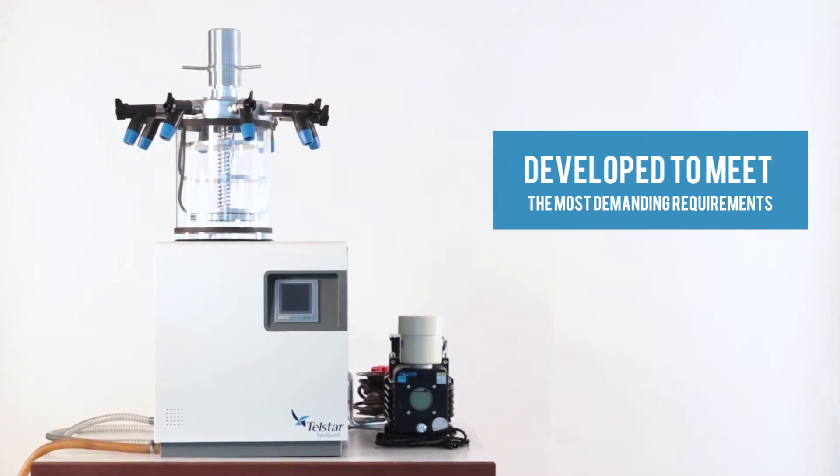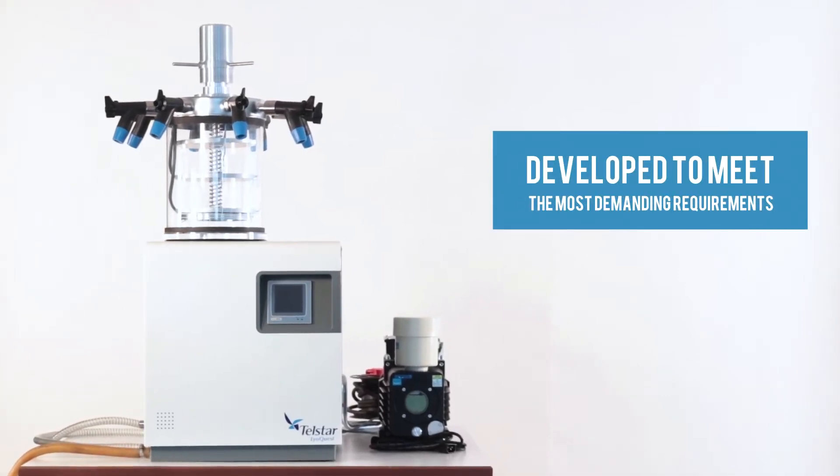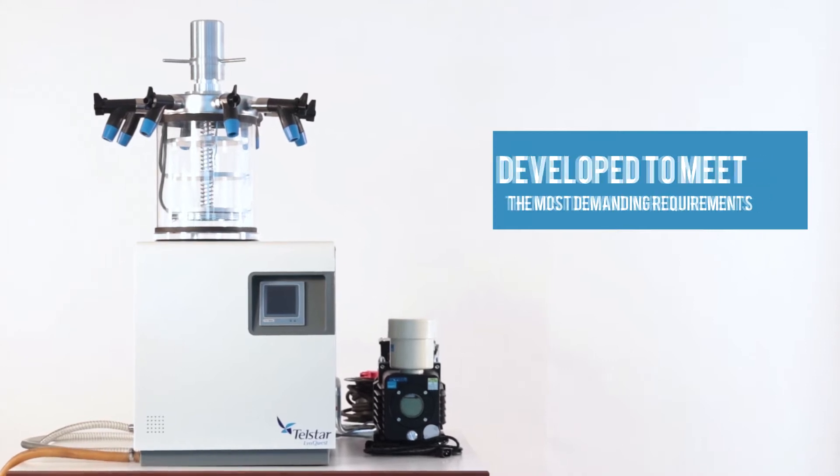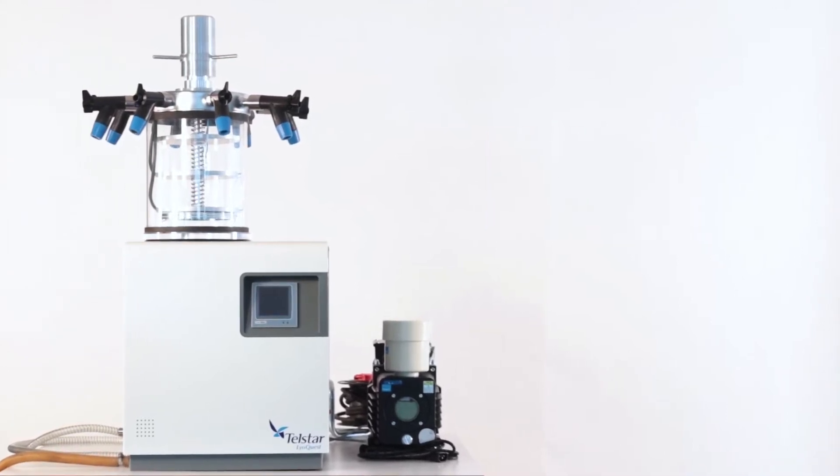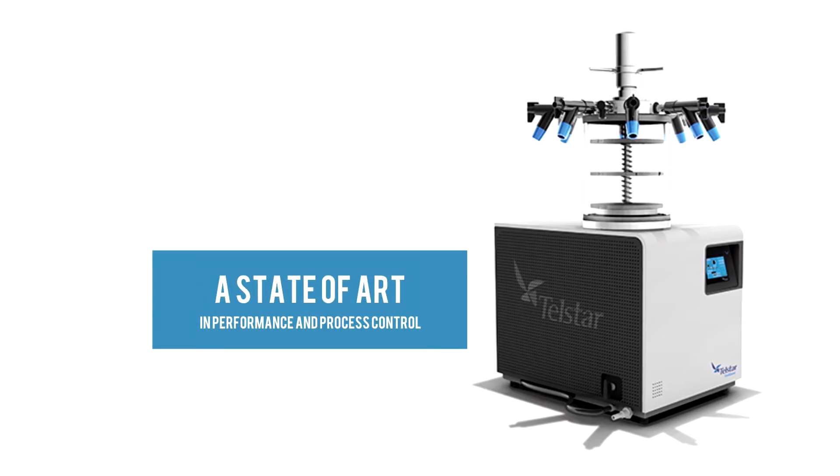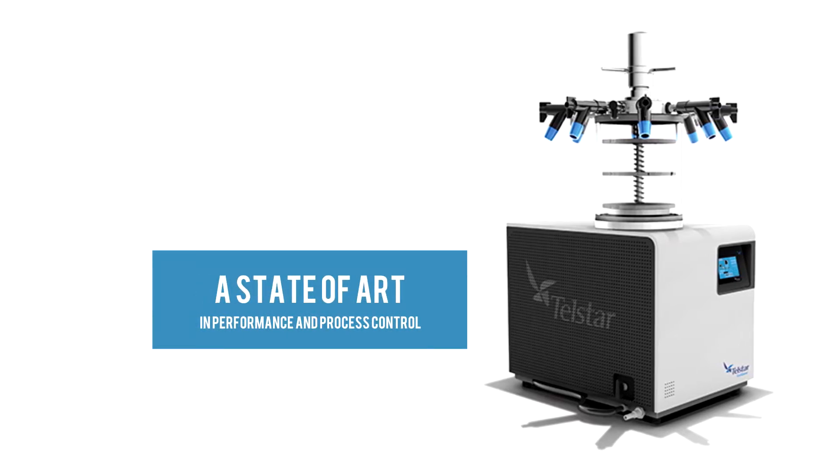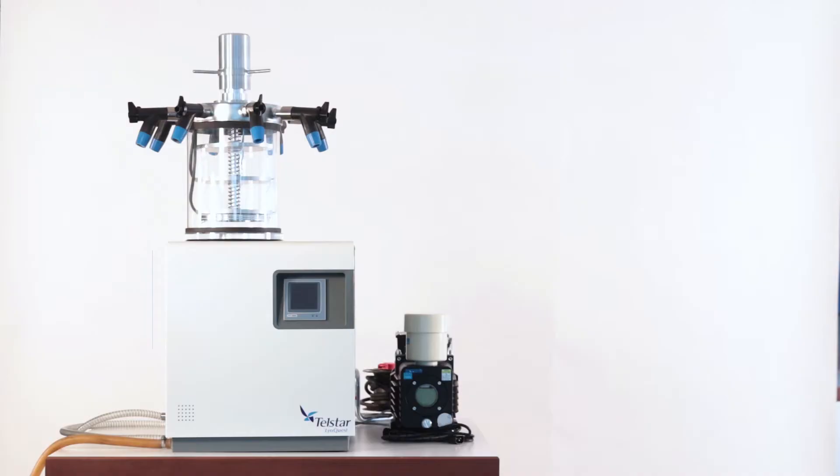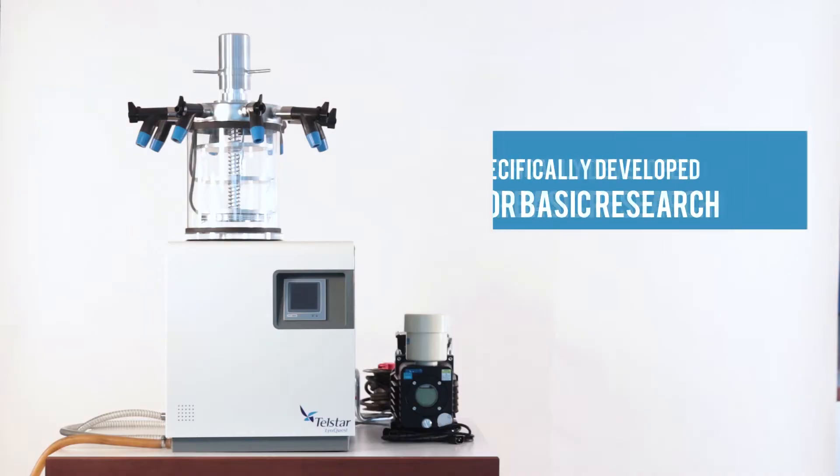The Telstar LyoQuest Benchtop Freeze Dryer has been developed to meet the most demanding requirements of a research freeze dryer. Telstar introduces the LyoQuest as state-of-the-art in performance and process control. The unit was specifically developed for basic research in biotechnology and scientific institutes.